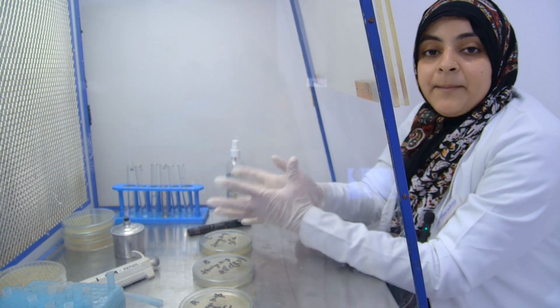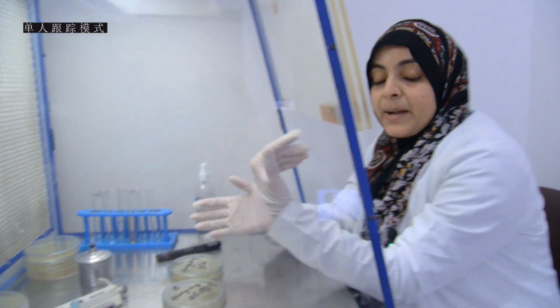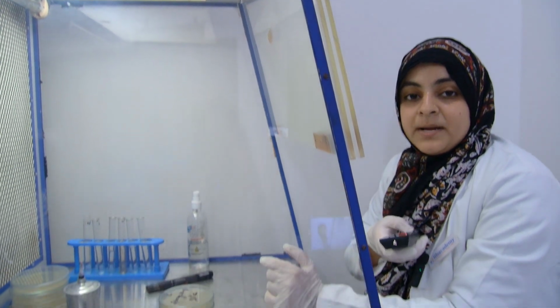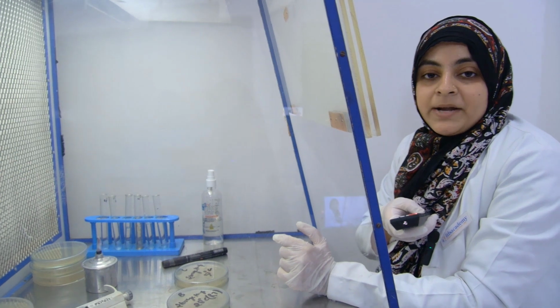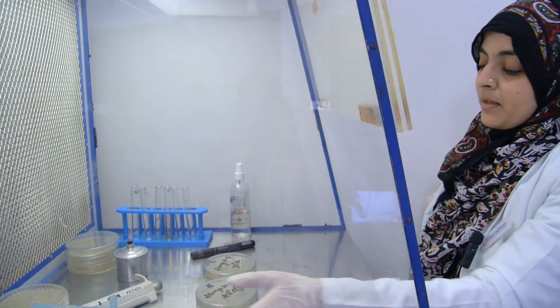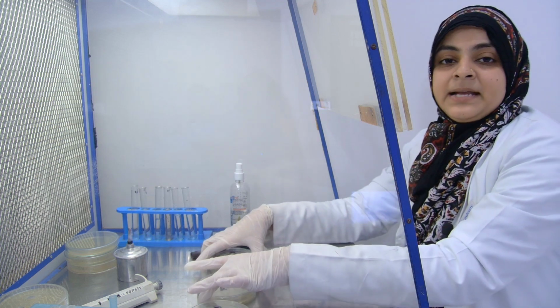we keep these Petri plates at their temperatures. Like the first Petri plate should be kept at 5 degrees Celsius, and then the second test tube kept at room temperature, that is 28 degrees Celsius, and the third test tube kept at 37 degrees Celsius.